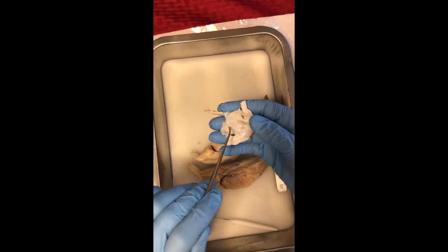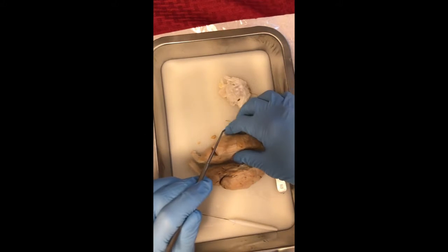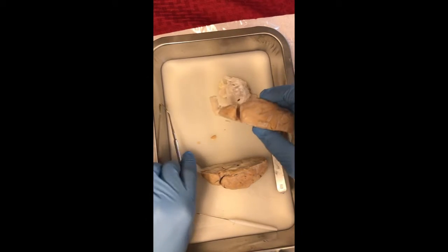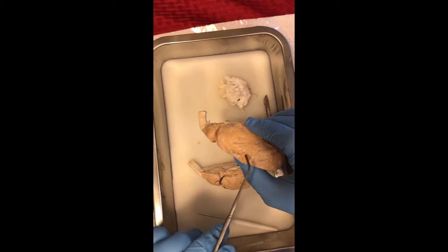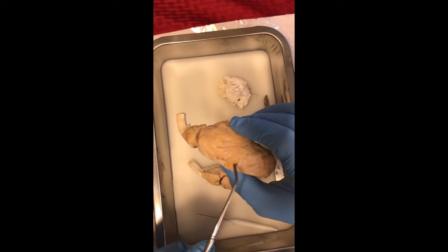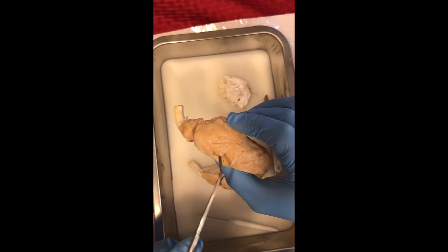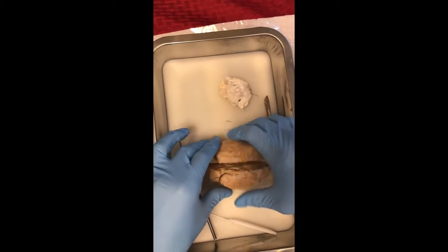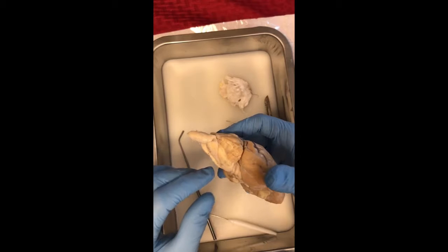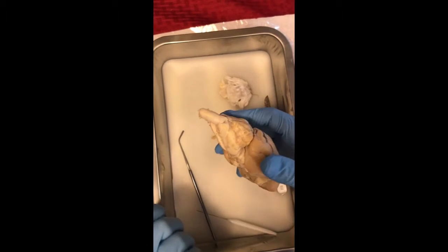Next is the arachnoid, and then the closest one is a kind of translucent membrane, the pia mater, and I cut away a little bit so that you can see more of it there. And then the pituitary gland is going to be located here on this side of the brain.